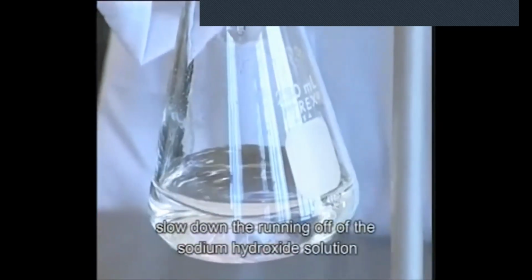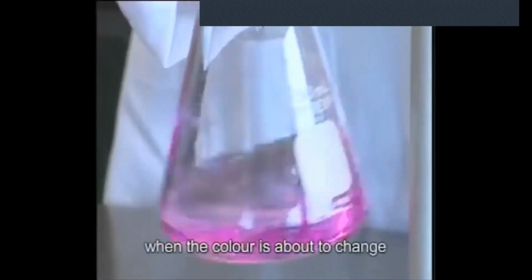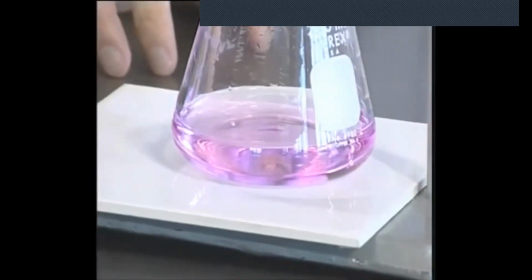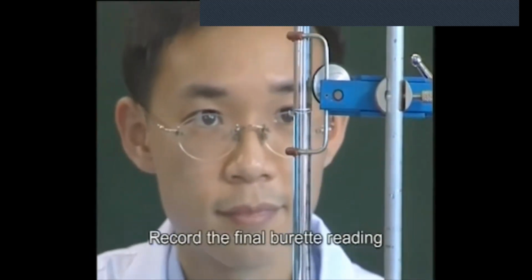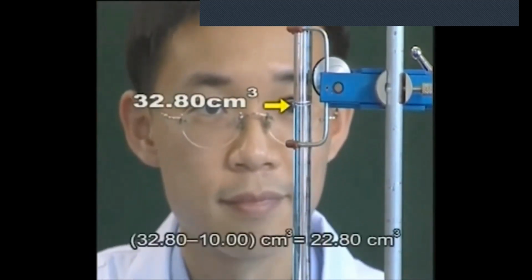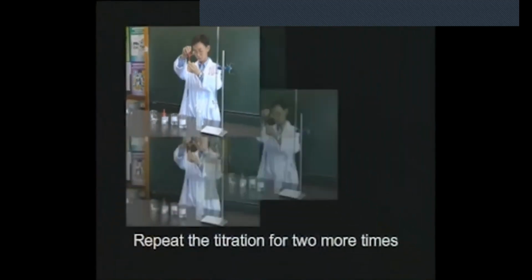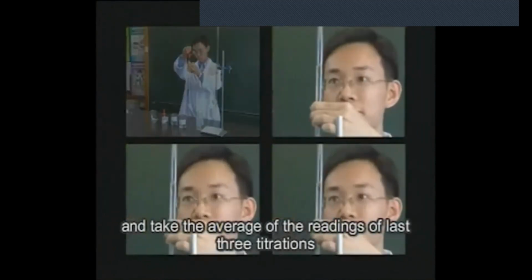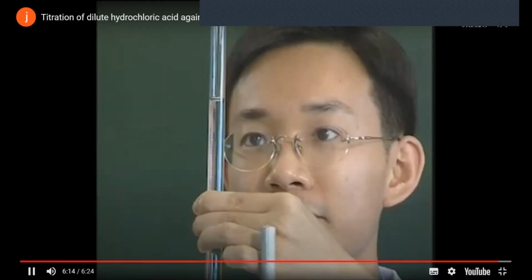Slow down the running off of the sodium hydroxide solution when the colour is about to change. Record the final burette reading. Repeat the titration 2 more times and take the average of the readings of the last 3 titrations.